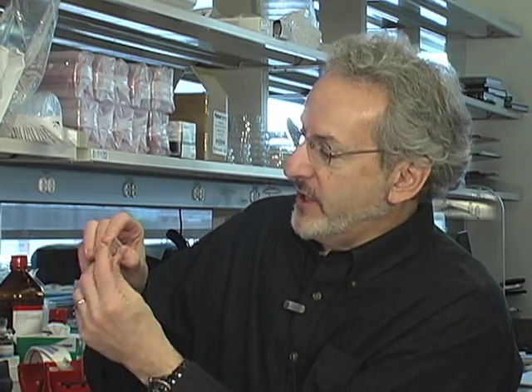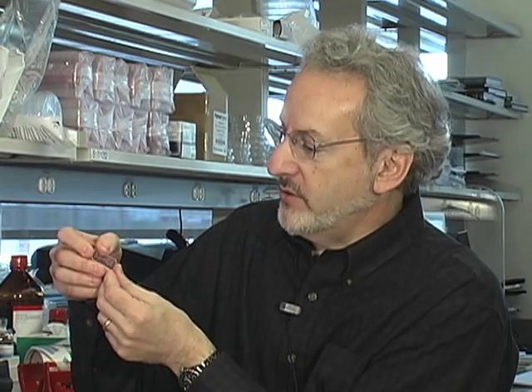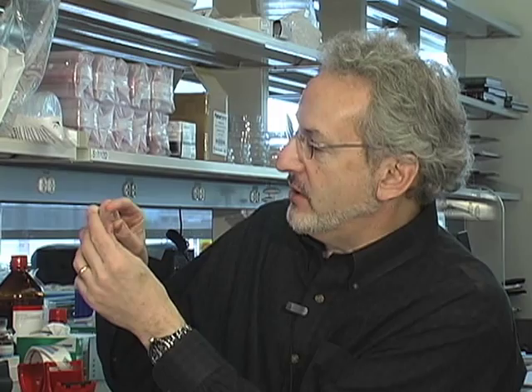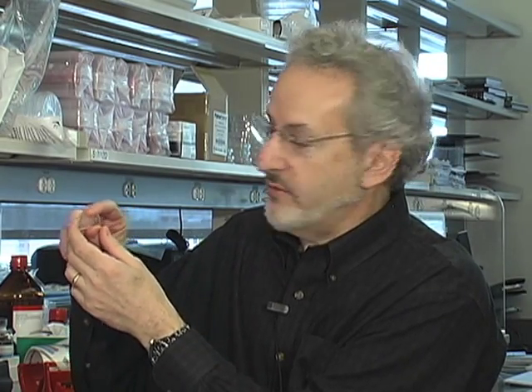I'm Don Ingber. I'm the director of the Wyss Institute for Biologically Inspired Engineering at Harvard, and I'm here because I was asked to describe this new device we've developed, which we call a human breathing lung on a chip. It's a little flexible device that's fabricated using microengineering techniques developed initially to make microchips for the computer industry, and we make small channels in here that are lined by human cells, airway cells and blood vessel cells, and it actually breathes, and we use this to test for drugs and environmental toxins, hopefully someday to replace animal studies.